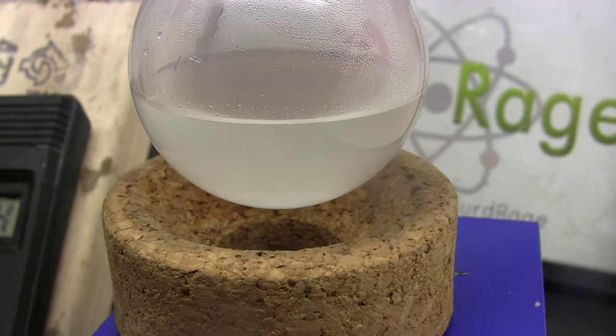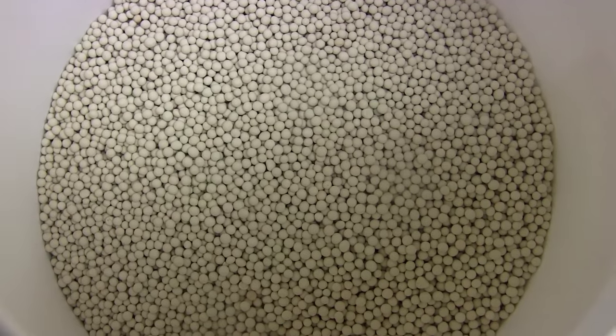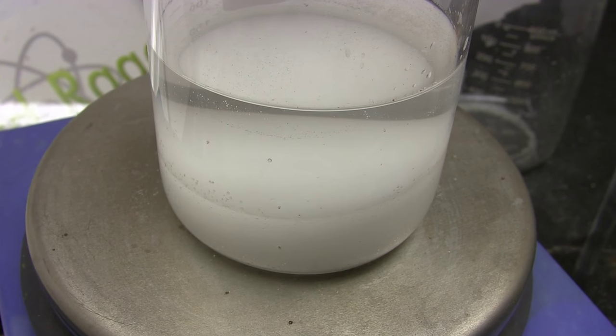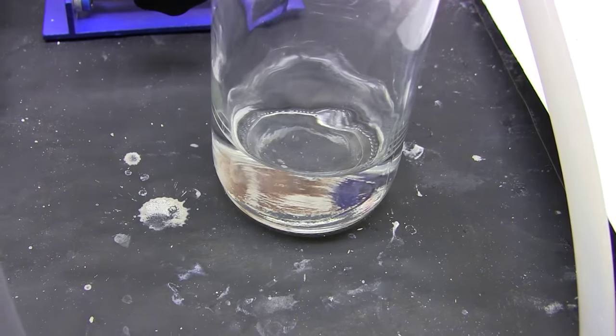Now we cannot dry it using molecular sieves since those decompose in acids like this. So instead we dry it with anhydrous sodium sulfate and then fractionally distill it. Now we get our proper boiling point of around 141 degrees. And there is our purified propionic acid.